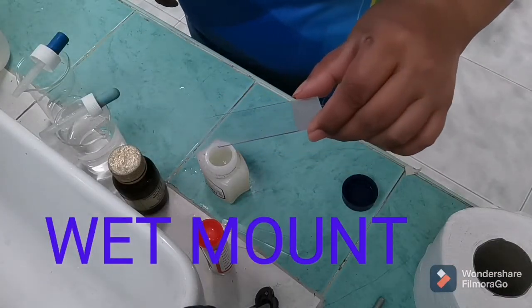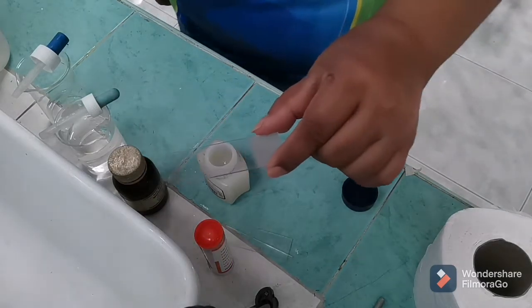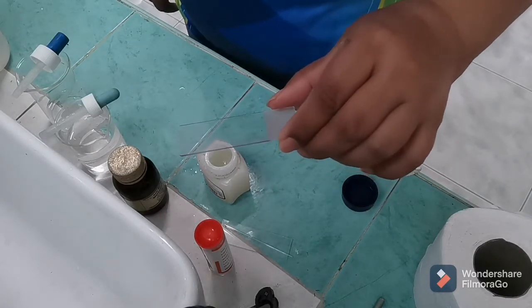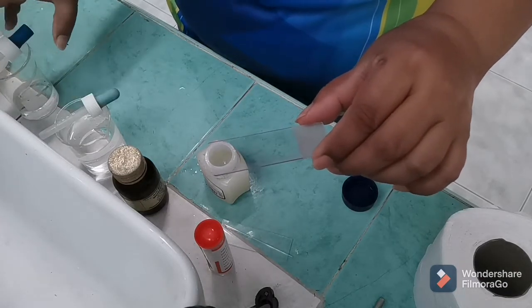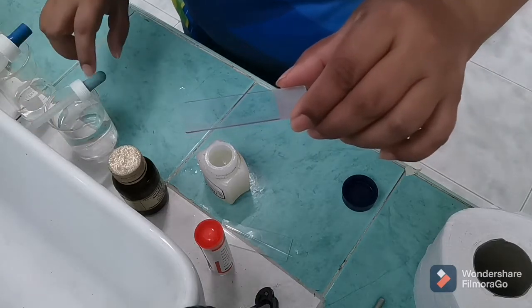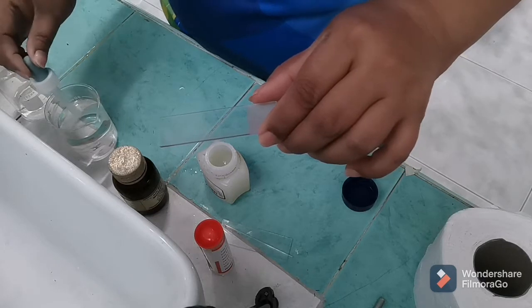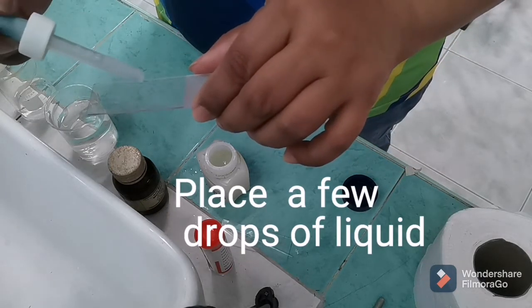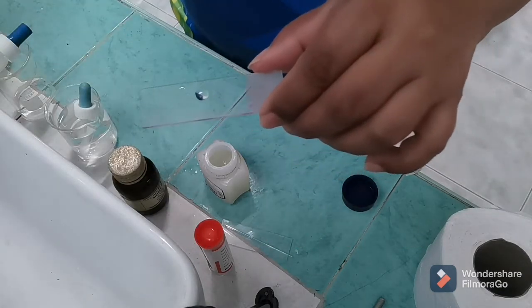We are now ready to prepare our wet mount. Of course, I have here my glass slide. The first procedure to do is to place a small amount of water. This is the sample, and this is distilled water. So I will just simply add a small amount of water. So you can see there.